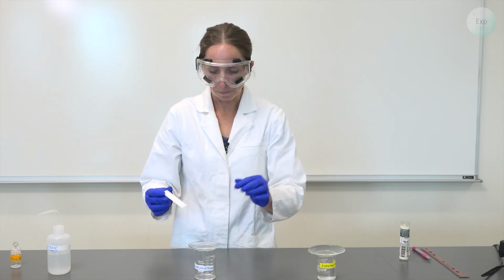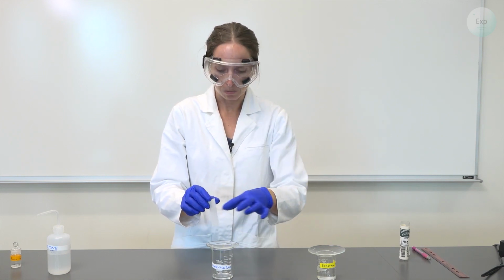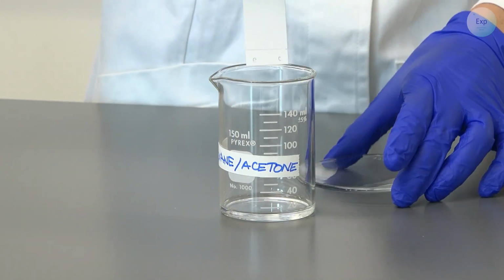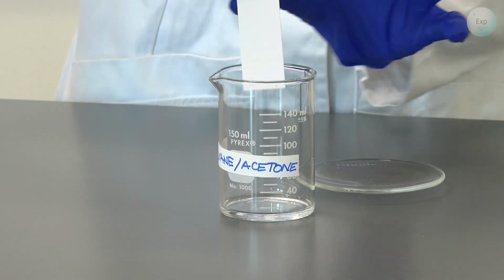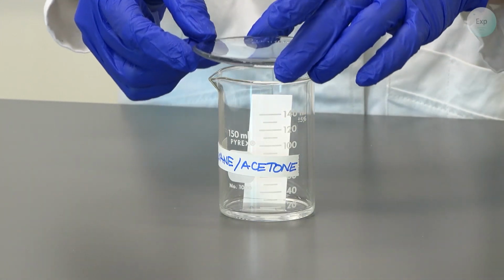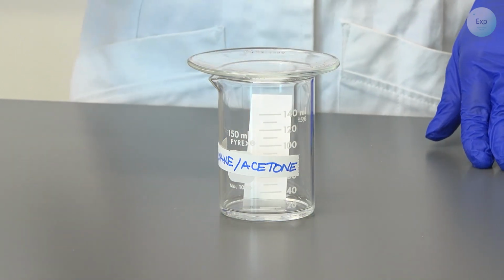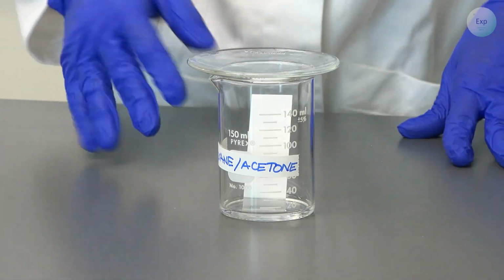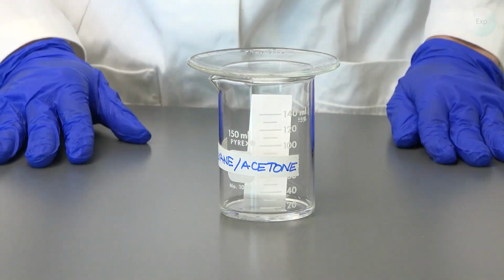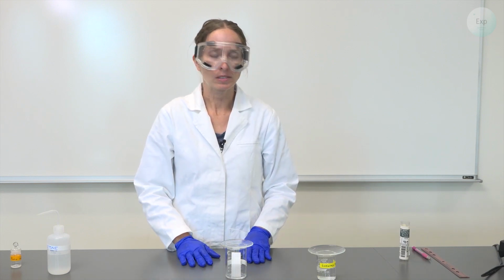Now it is time to run the TLC. Very carefully, I'm going to lower this down as evenly as possible into the solvent mixture. I will touch the bottom to the beaker and allow the top of the TLC plate to rest along the wall of the beaker. Now we wait for the solvent height to come up between 1/2 to 2/3 of the way up the TLC plate. You will be able to see the solvent moving up the plate. So now our solvent has moved up about halfway up the TLC plate.